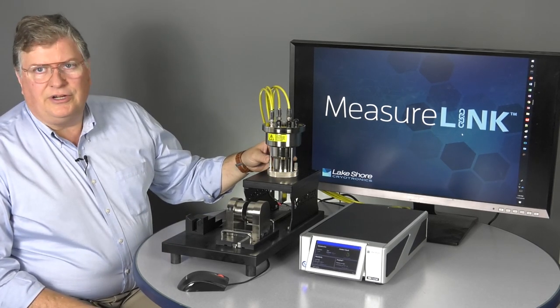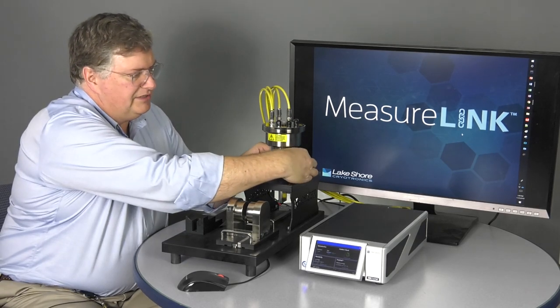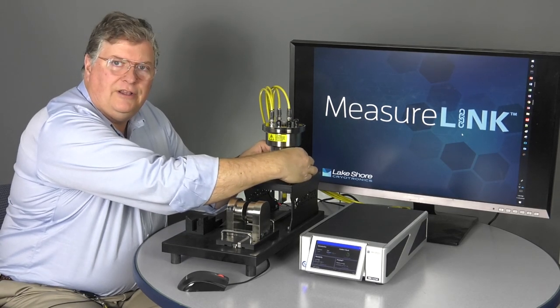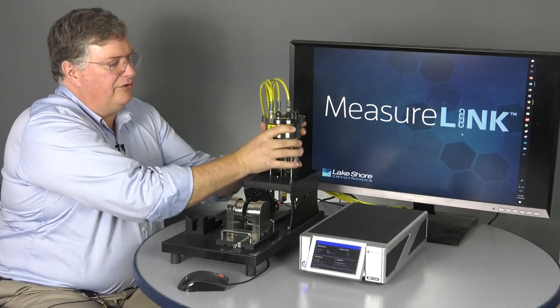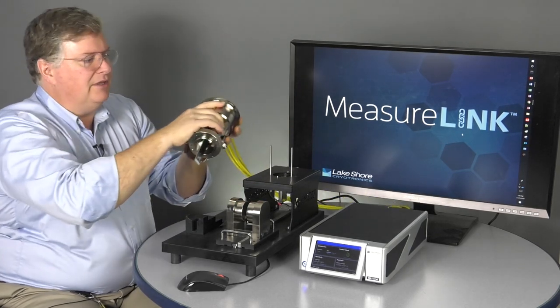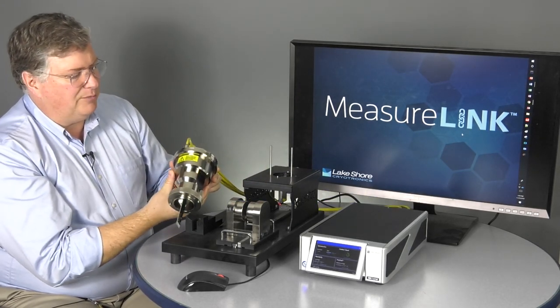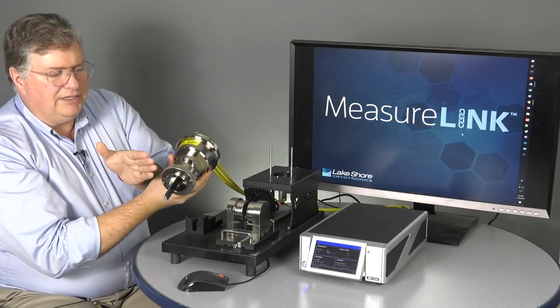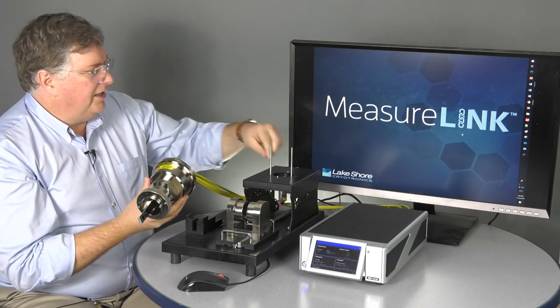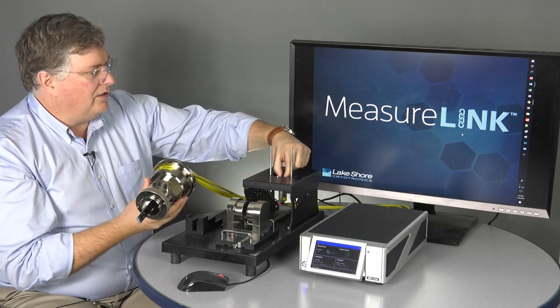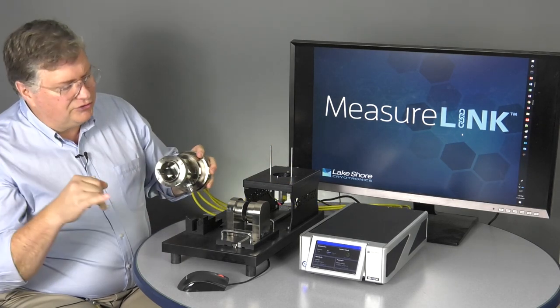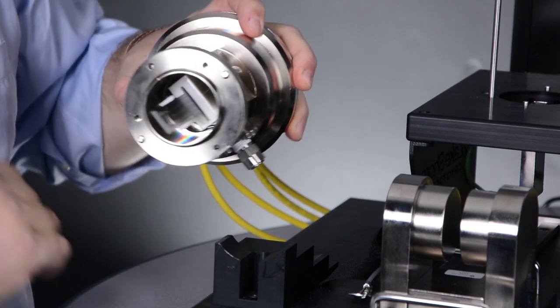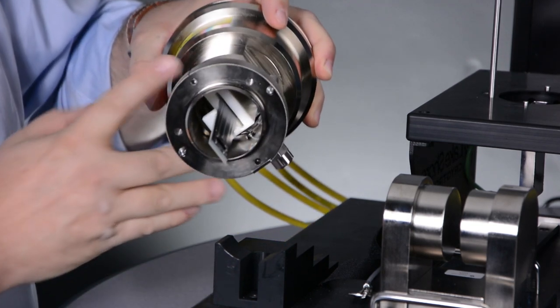Looking a little bit closer at what we've done here, the sample holder we've integrated from our 8400 premium electromagnet system. This is a very high-performance sample holder. It is completely electrically shielded, including the top of the sample well here. The sample well provides us a complete electrical shield all the way up, so that it really minimizes electrical noise.